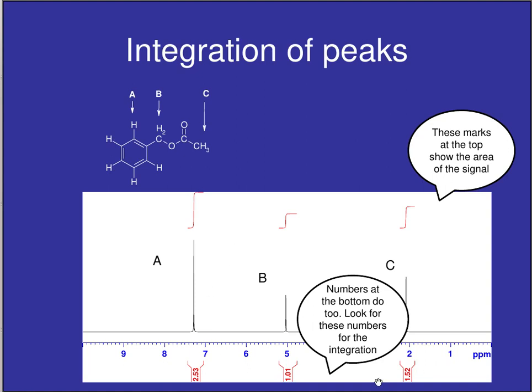So you see the 1.5, the 1 and the 2.5 are showing a ratio over here. Have a look at the molecule of interest, and you'll notice it has 3 chemically equivalent protons giving rise to a signal, 2 chemically equivalent protons giving rise to a signal, and a whole mess of protons that give rise to an overlapping set of signals.